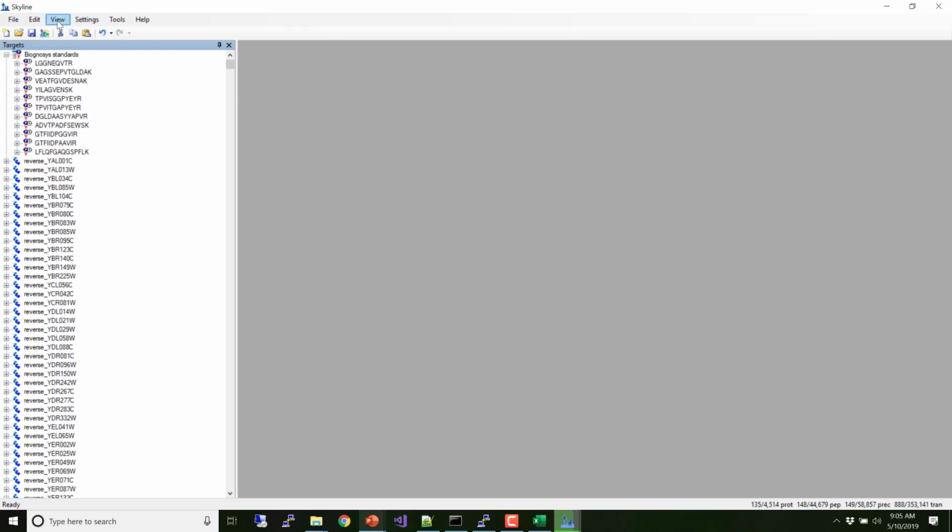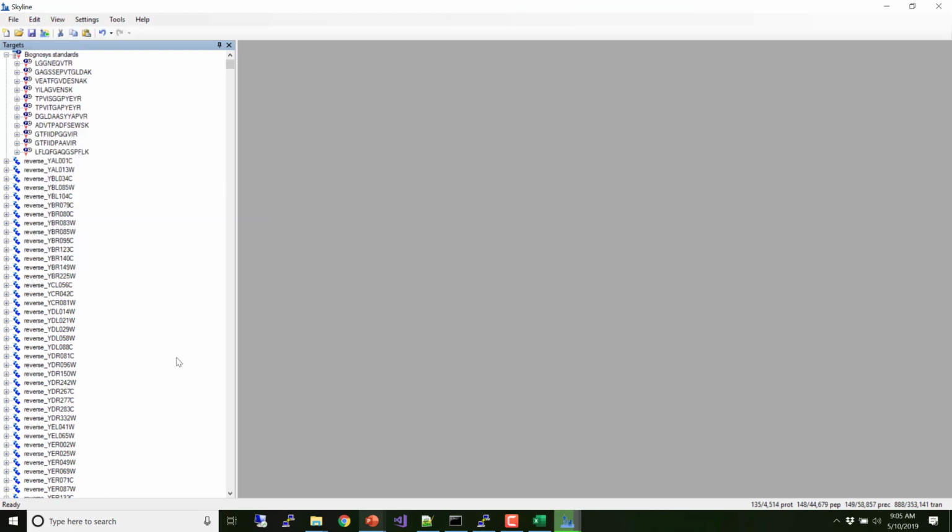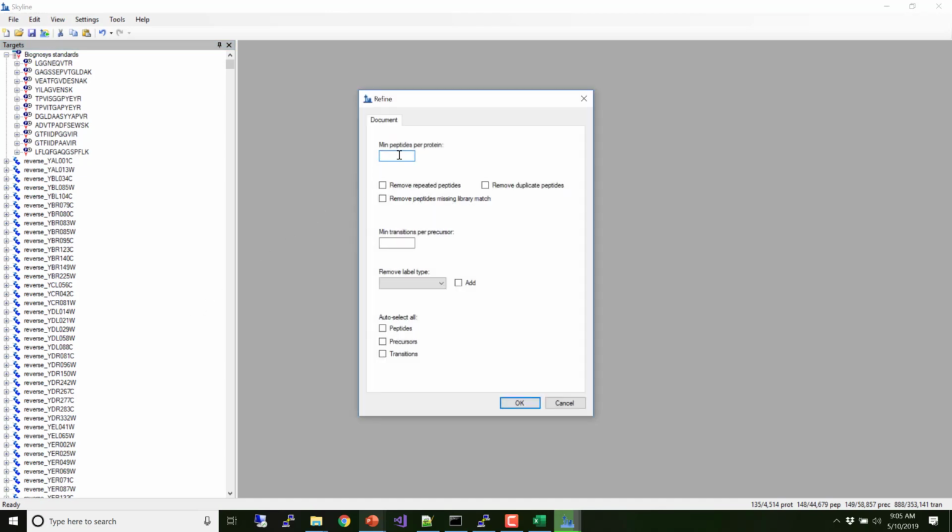Okay, so another thing we need to do is remove duplication. So let's go to Edit, Refine, Advanced. And we want minimum peptides per protein. Well, let's just say 1. Any protein that's got 1. If we said 2, we would get rid of most of those reverse hits. But we're going to be more permissive. We say 1, and then we also want to remove duplicate peptides. And that's all we need to do in this refinement.